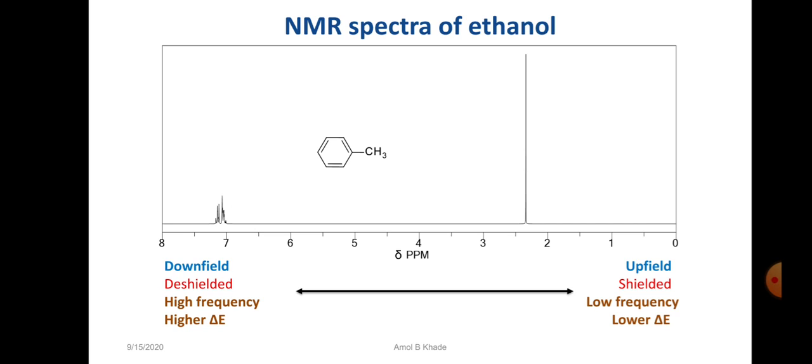Now as per the international convention, there are certain guidelines to be followed whenever we record NMR spectra, for uniqueness. NMR spectra are always plotted by taking the TMS value on the extreme right side, which is considered as 0, and with respect to this all other peaks are plotted.